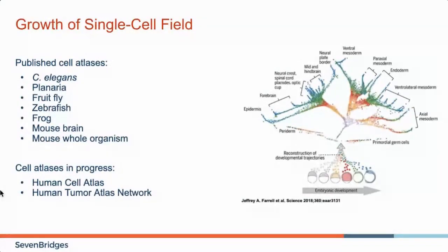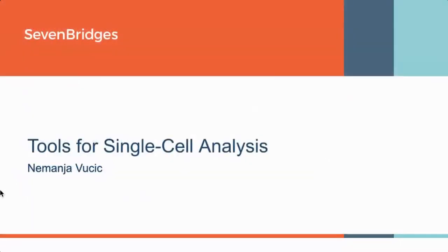And we've also made tools to do these trajectory analyses available on the platform as well. And we'll actually talk about this in the next section as well. So now I'm going to transition over to Nemanja, who will go through the actual tools themselves.